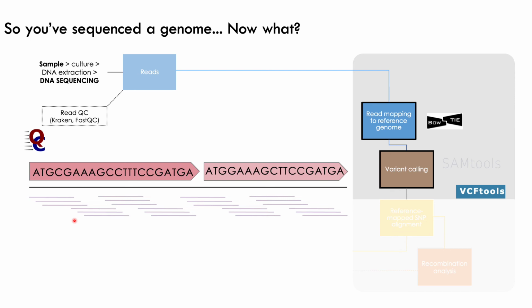Occasionally you'll have some errors, and if you've got errors, you'll have what's called the consensus sequence. So in this example here, I'm using the black dot as a SNP. It could be a different type of variant, like an indel, but for this example, it's a SNP. But it's only in one of the 3 reads at that position.